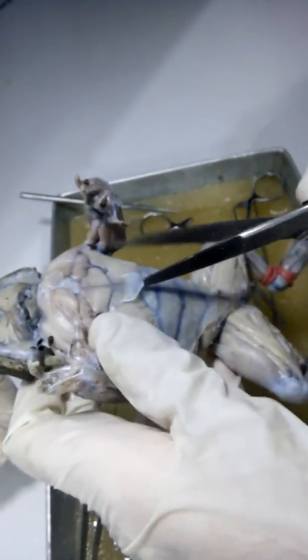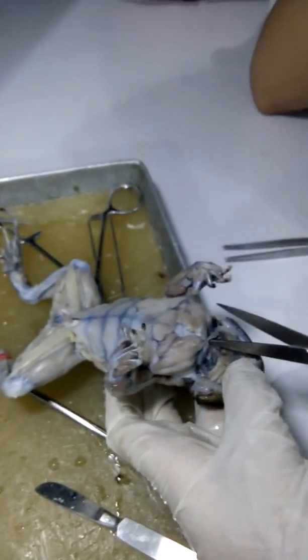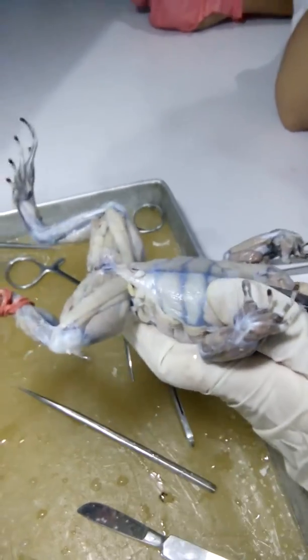Okay. So let's try to open your trunk nga region to see your mga glossus, mga hyoid.